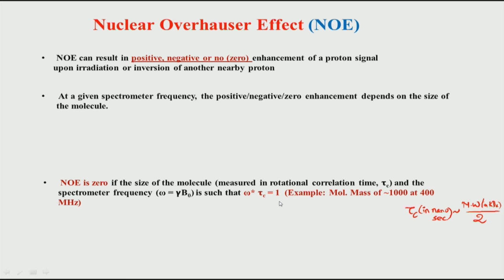This is a very important point in NMR. By playing around with temperature, you can modify the tau c of a molecule, and this is very routinely used in biomolecules, because we want to go to higher or lower temperature for exploiting the favorable properties.